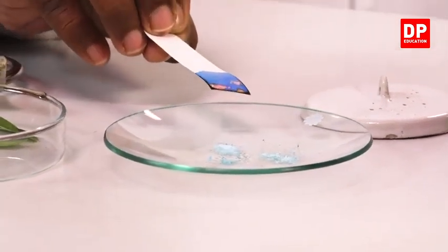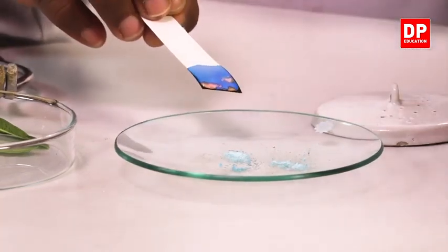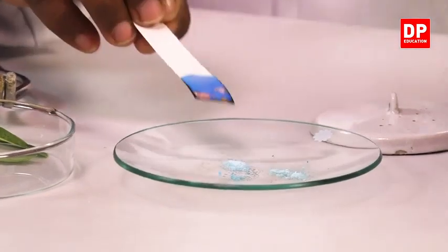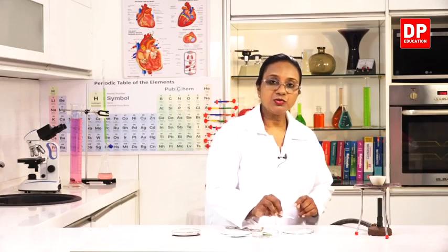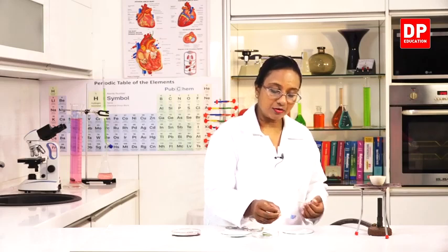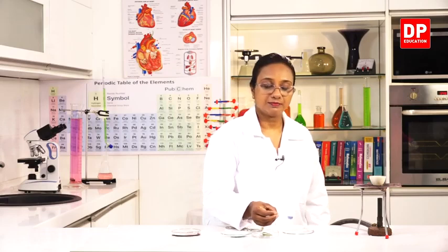So here you all can see, students, the copper sulfate has become blue in color. This blue part is the anhydrous cobalt chloride. Wherever there was water, it has become pink in color. So these two observations confirm that the vapor that came out and condensed on the watch glass is water.